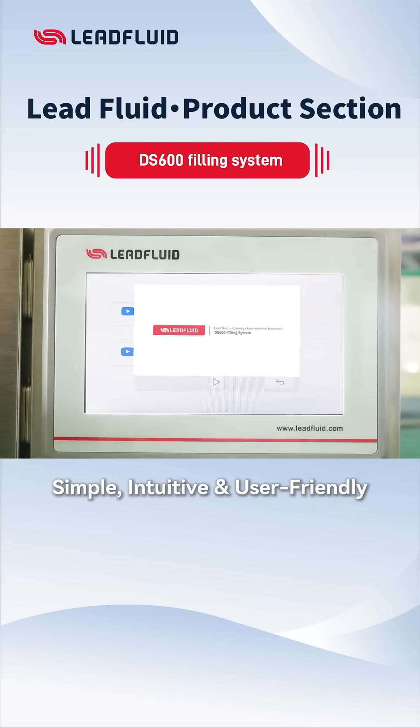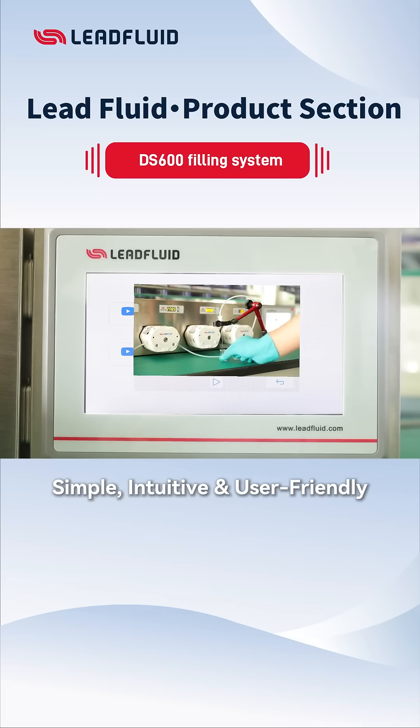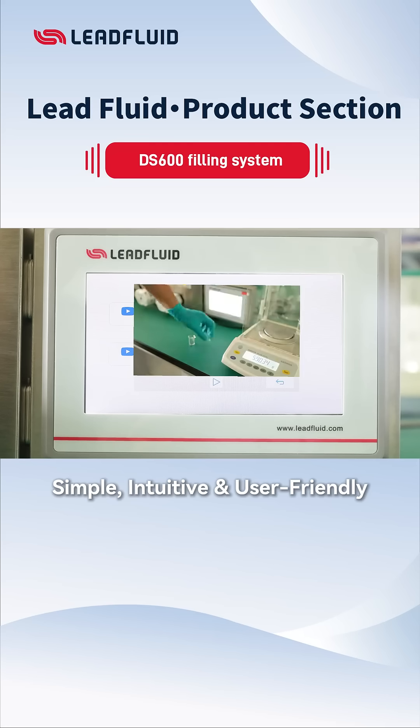At the same time, it also supports video guides and intuitive operation guidance to help new users quickly get started.